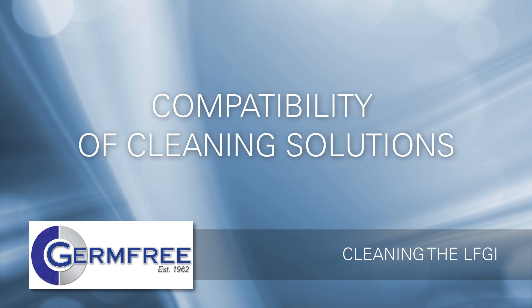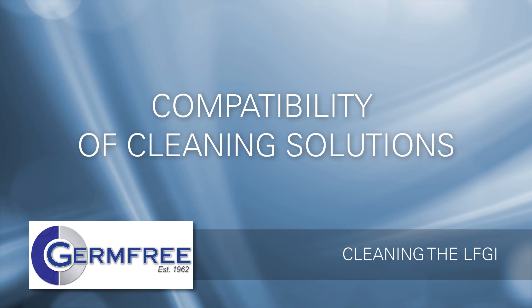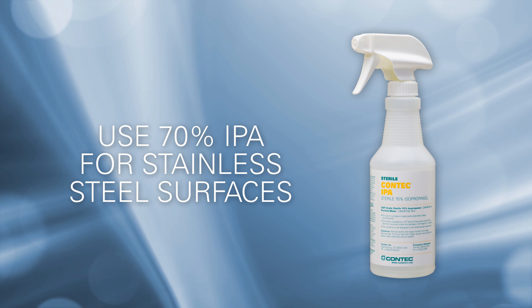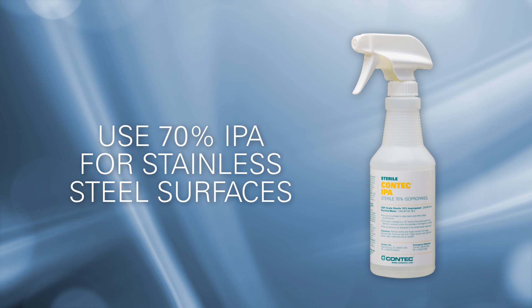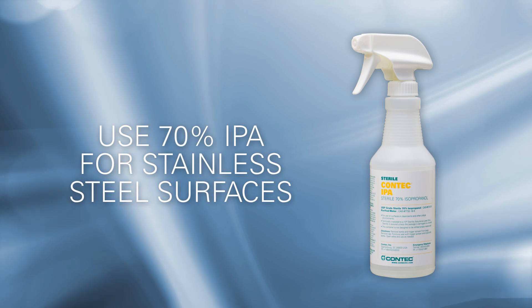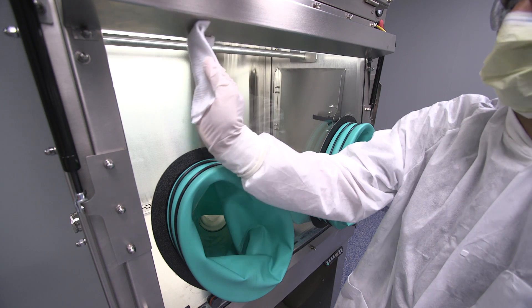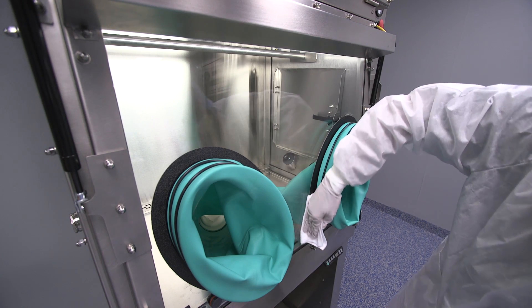Your LFGI is designed and built to provide many years of reliable service when properly maintained. Use the right solutions for each type of surface. On stainless steel surfaces, use a 70% isopropyl alcohol solution or a solution that has been formulated for stainless steel. Acrylic front and side panels should be cleaned with a soft cloth and a mild detergent or a solution that's specifically formulated for cleaning acrylic.